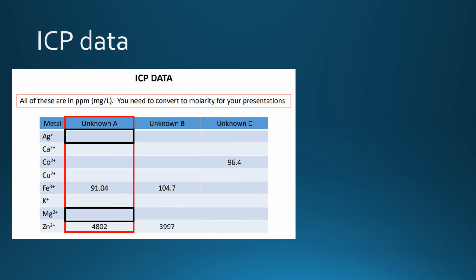This could be due to many reasons. It could be that the concentration of these ions wasn't high enough for the machine to pick up, but I'm not entirely sure as to the sensitivity of this machine, so I'm not sure how good of a reason that is. Another thing is that it's quite new, so it's possible that the technique that was carried out was done incorrectly and it resulted in no data being recorded for these 2.